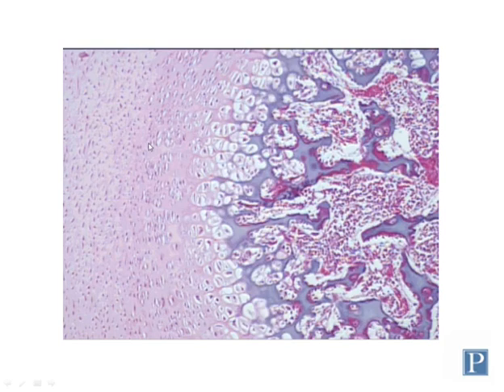So here's a lower magnification view of this long bone that's undergoing endochondral ossification from a cartilage template. I'm going to go through these layers again real quick so you can see them all together. This outermost layer towards the epiphysis, here's the epiphysis out here, this is the diaphysis of the bone. This outer layer is the zone of reserve cartilage.